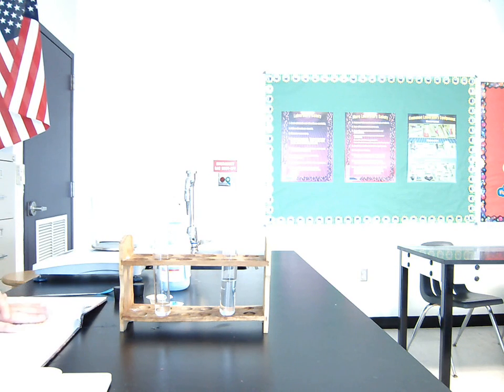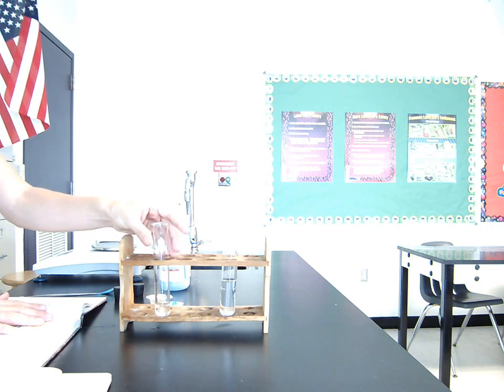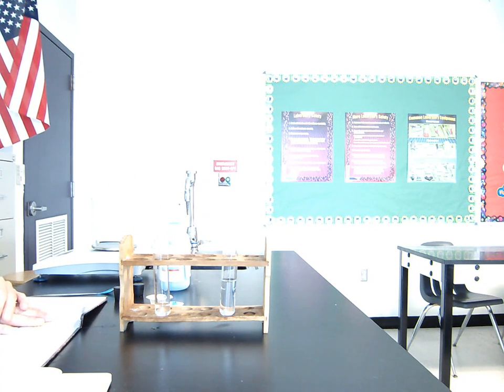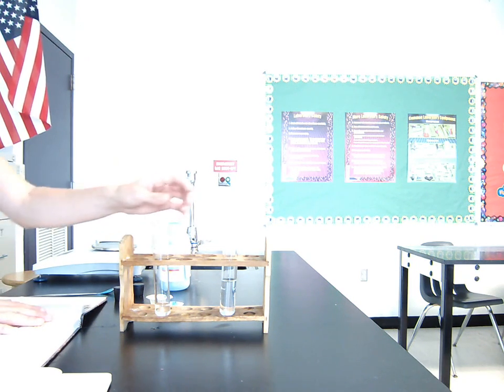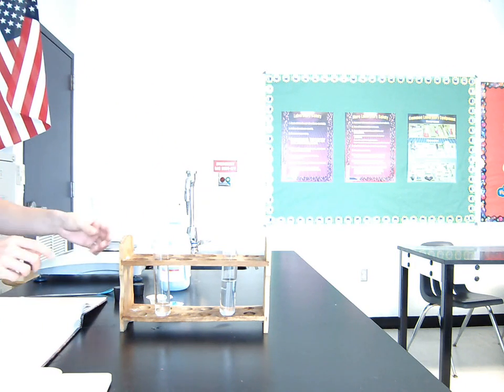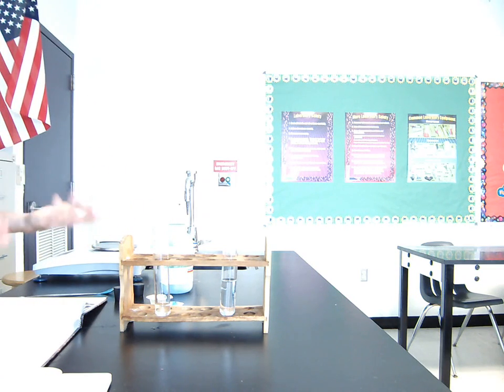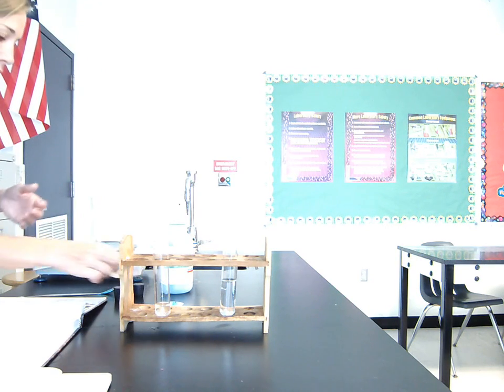The first new vocabulary term that's being presented in this chapter is the word solution. So a solution is basically any time a substance dissolves into another substance. In this case, we have water. Water is our solvent. That's another vocabulary word that we're going to be getting into in the next section. The solvent is usually the liquid that's being dissolved into. What we're going to use for our solid in this case is this stuff called copper acetate. I like to refer to it as blue stuff just because the nature of the substance doesn't really matter. So calling it blue stuff will be sufficient for what we've got to do.